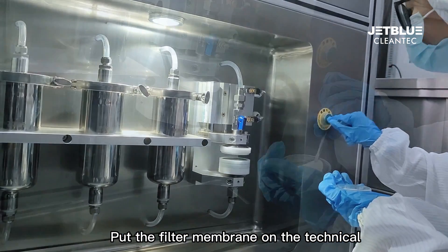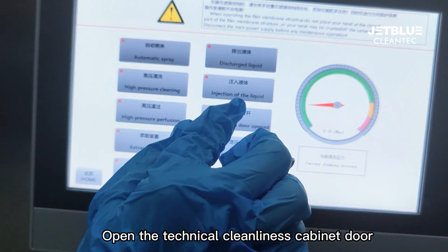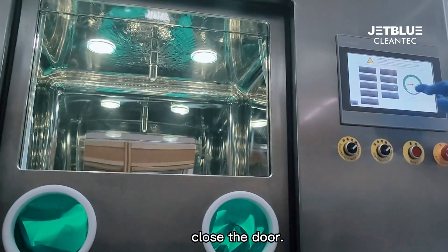Put the filter membrane on the technical cleanliness cabinet filter membrane holder. Open the technical cleanliness cabinet door. Put the component to be tested in the cabinet chamber, then close the door.